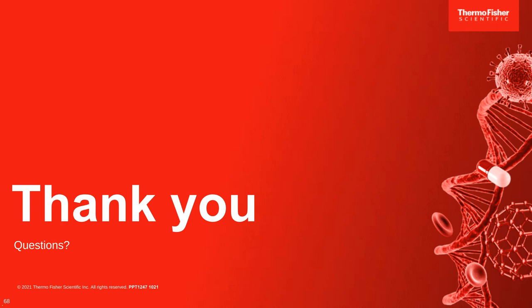So let's get started. Our first question is, if I wanted to switch between applications, such as moving from DNA extraction to protein isolation, is this a difficult process?